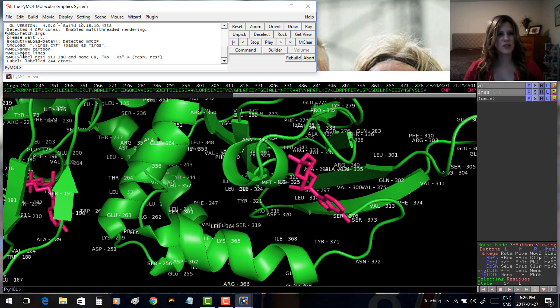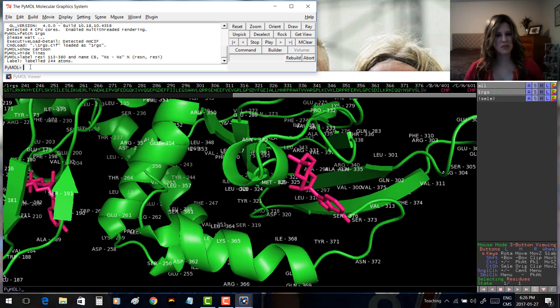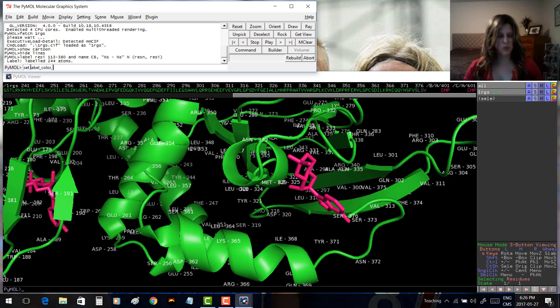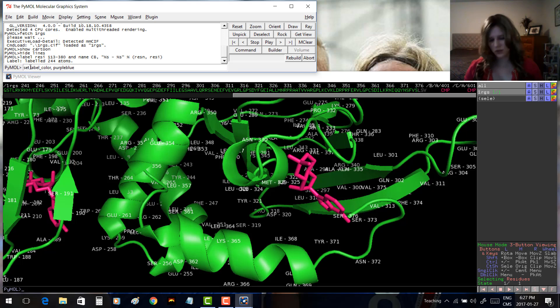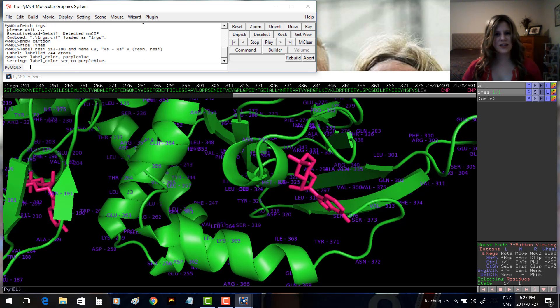Let's say we'd like to change some things about these labels. Maybe we're not happy with the white color and want a different one. Type 'set label_color, purpleblue' — that's one word in PyMol's naming system — and press Enter. That gives us a purple-blue color for the labels.